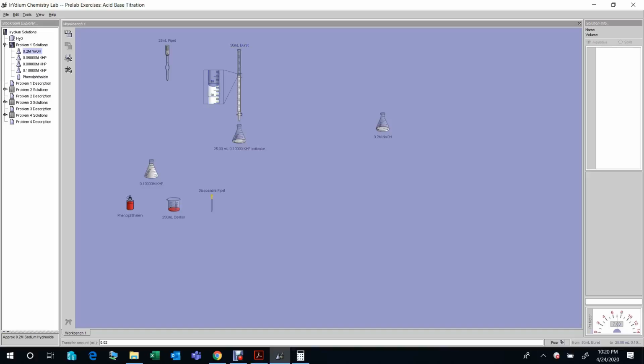As you see, as you keep adding, this liquid level keeps going down. I click once and you can see the volume going down. At the same time, we need to pay attention to the color change. You pour again. Again. Again. You see, there's some color change, right?